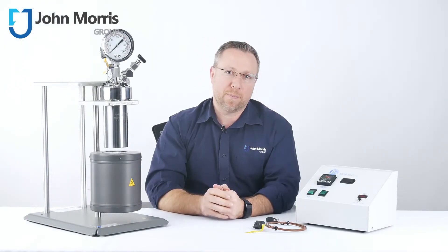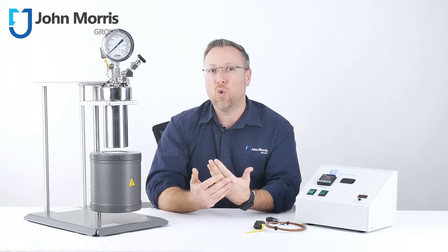You can also have your reactor customized with viewing windows, magnetically coupled stirring, additional ports for high-pressure probes, catalyst addition or removal, etc.